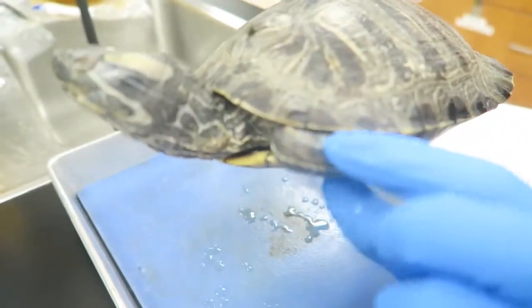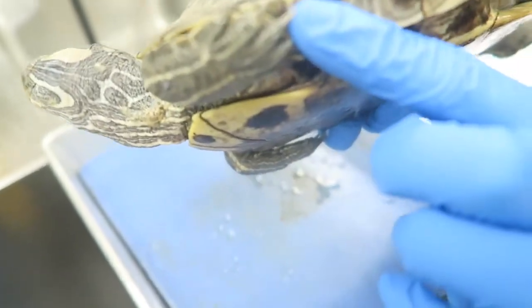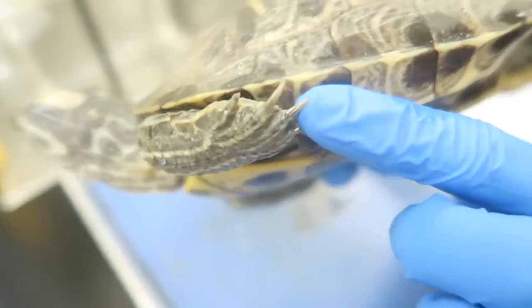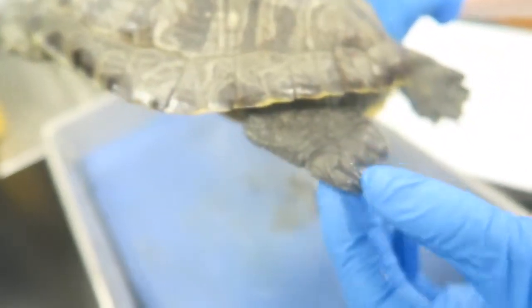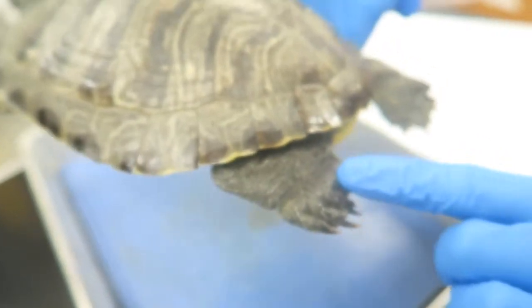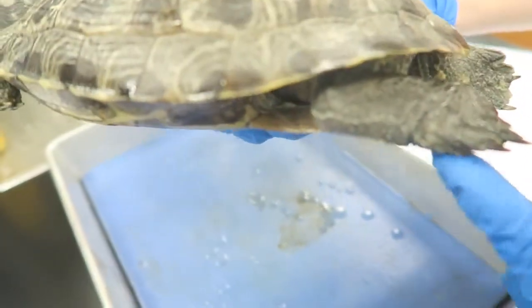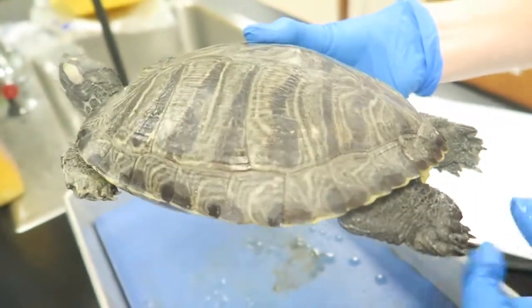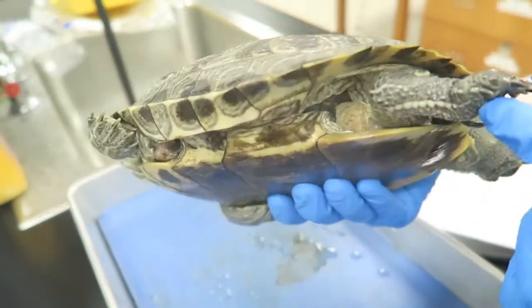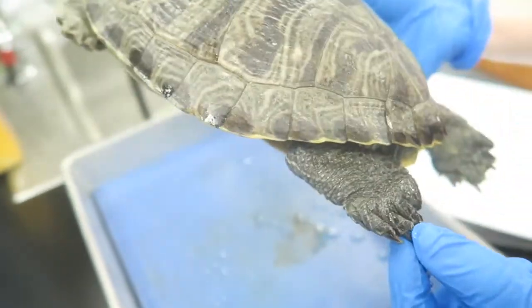The forelegs are covered in scaly skin and they have claws, which allow the turtle to climb, dig, and move. Moving down to the hind legs, which are actually longer than the forelegs and shaped kind of like a paddle, which increases water resistance in the water, allowing the turtle to swim. This is actually an adaptation of animals that live in both terrestrial and aquatic environments.